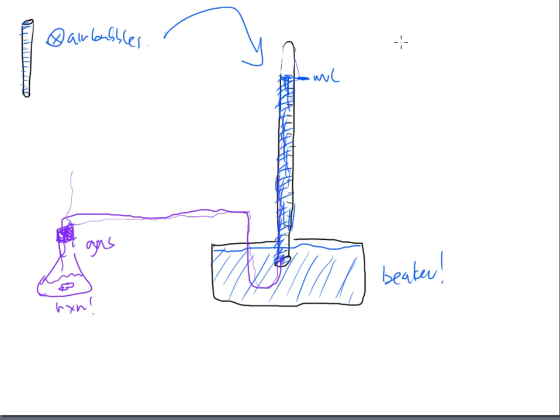And that can be read as far as milliliters of gas or milliliters of water that is left over in the eudiometer. All right, so again, read it like a burette, but now I've been able to capture really the milliliters of gas, which is the most important piece here, for our equation that we will use a little bit later on.